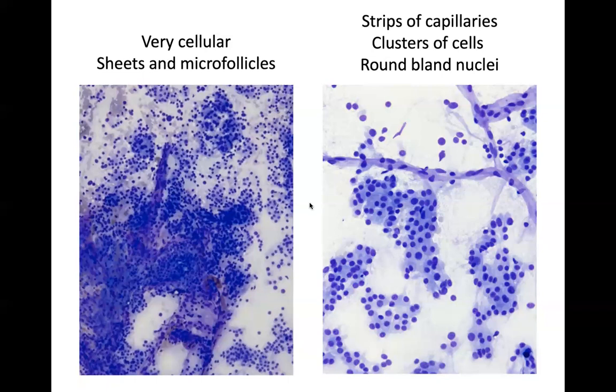All right, I'm going to thank you for those of you who answered. I'm going to end and share. And so probably for a benign diagnosis, these are a little too cellular. So the thing is, we can confidently make benign diagnoses on FNA when usually there's lots of colloid and the nuclei are bland. But in cases that are colloid poor, are highly cellular, but the nuclei are bland, what is your concern?